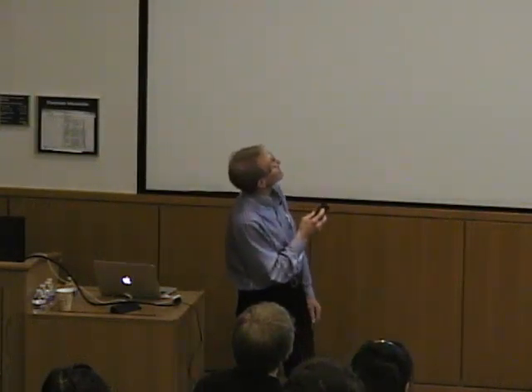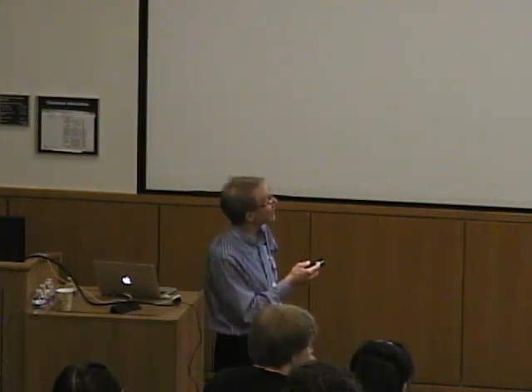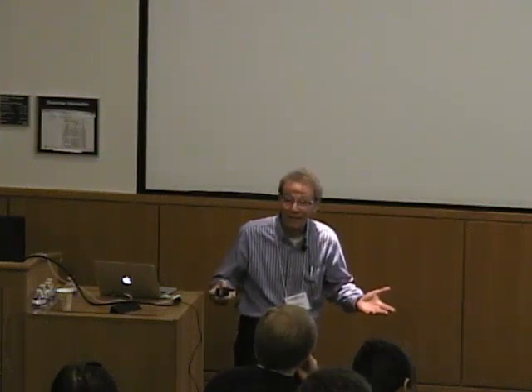All right. Technical issues, red flags. Noisy data. Oftentimes you might find there's a precipitate or an air bubble that can lead to noisiness, turbidity, if you will. Irreproducible results. Cleanliness, very close to godliness in this field. Clean the cell, make sure it's nice and clean, make sure your samples are clean, there aren't any interfering things. Again, air bubbles. Sometimes the irreproducible results are the chemistry that you're studying, so sometimes it can be a clue that you find.